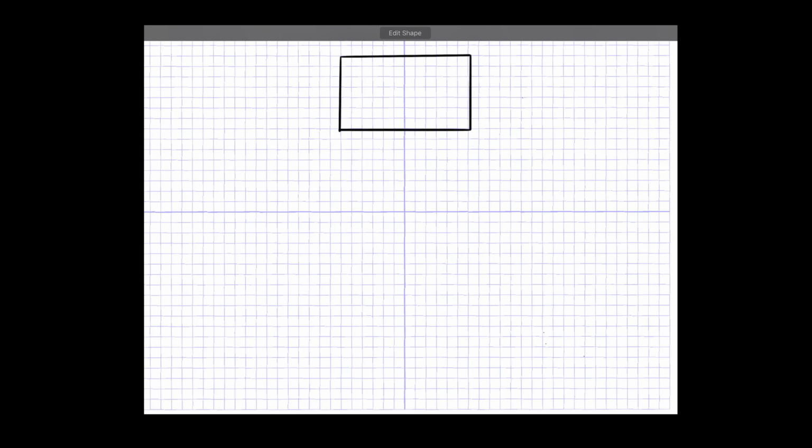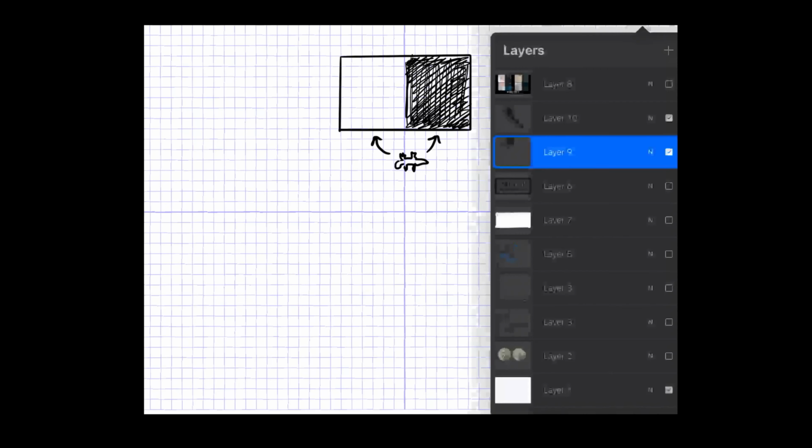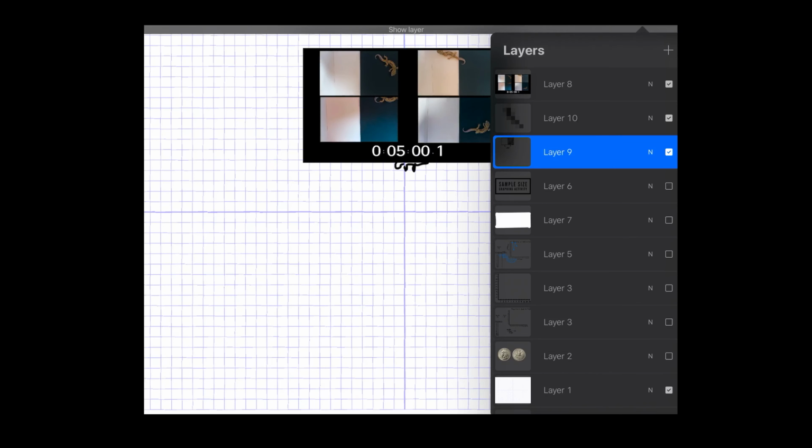There is a choice chamber, which is an area that limits the movement of the gecko, so it is forced to either be on a light side or a dark side. These sides are the same size to control for the area. And the gecko, here's my terrible gecko. The gecko has a choice to either be on the light side or the dark side. That's going to end up looking like this.